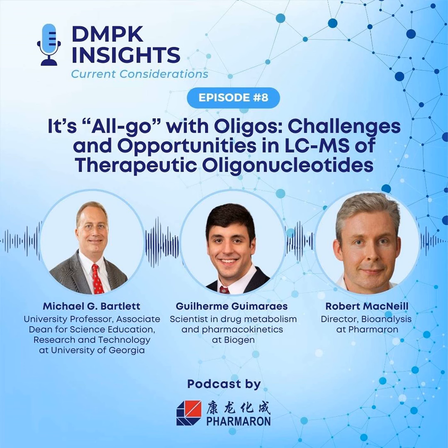I think we're approaching an interesting era with triple quads, right? We're obtaining so much sensitivity from these, and it's almost like, how much sensitivity do you need, right? And we keep pushing these limits, and so it'll be great to see some of the instruments with higher resolution. I know there's a bit of a trade-off with sensitivity there, but if sensitivity from these instruments would pick up a little more, like we are seeing with new instruments coming in, I think that would be a huge help, right?